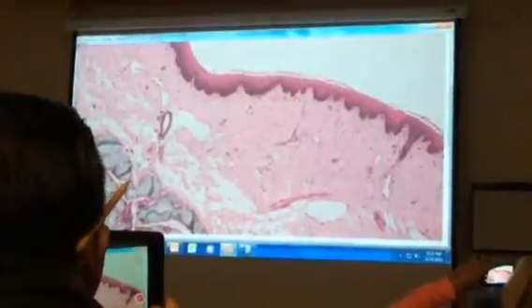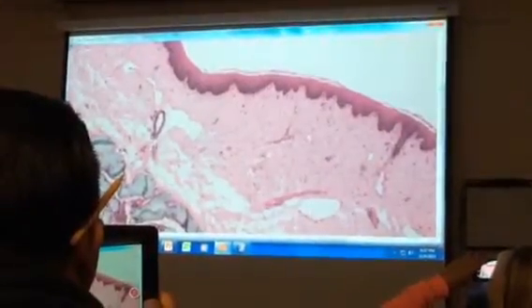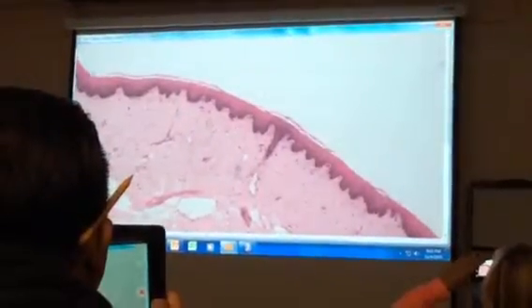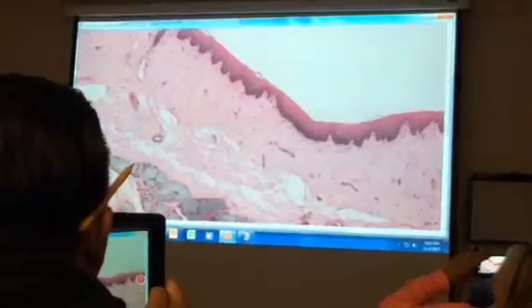Slide that we have that has that. We don't have a slide of the oral cavity or the rectum, other places that would have it. So that's your tip off. This is the esophagus. Okay, I want you to be able to identify the organ. Okay, let's do the main layers now.